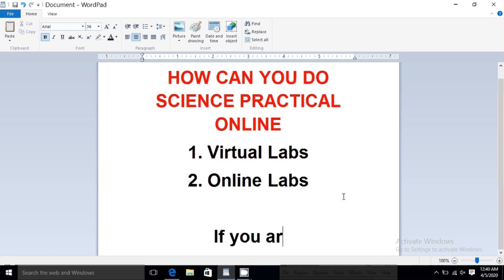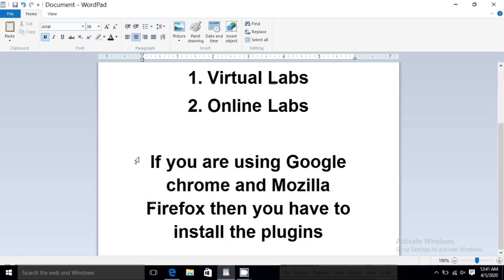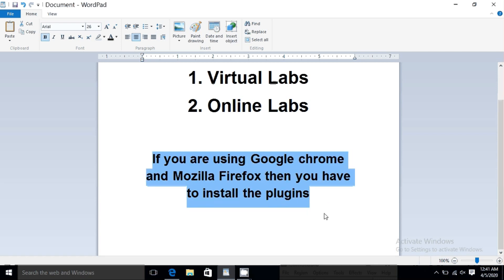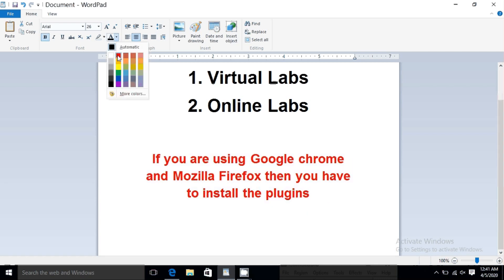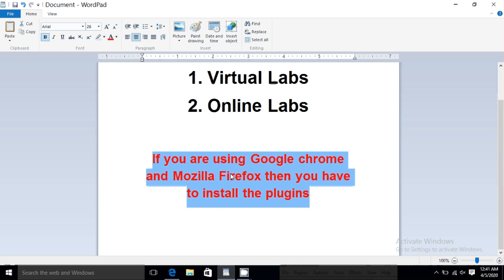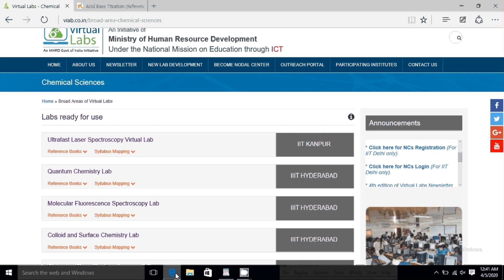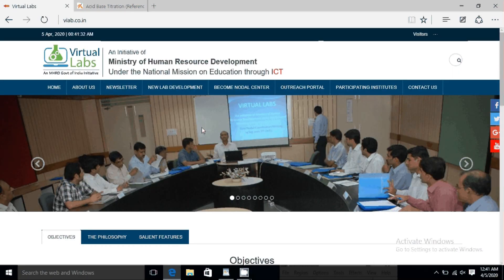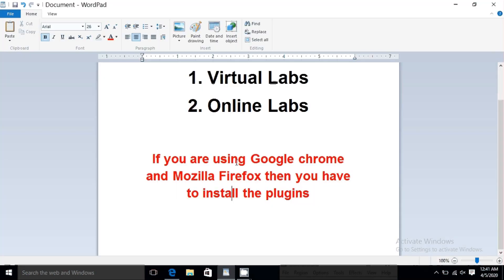Online Labs is basically for school education. Before starting, if you are using Google Chrome or Mozilla Firefox, try to install the necessary plugins first, then start your process. I am currently working in Internet Explorer, but for Online Labs I will show you how to access it through Google Chrome.